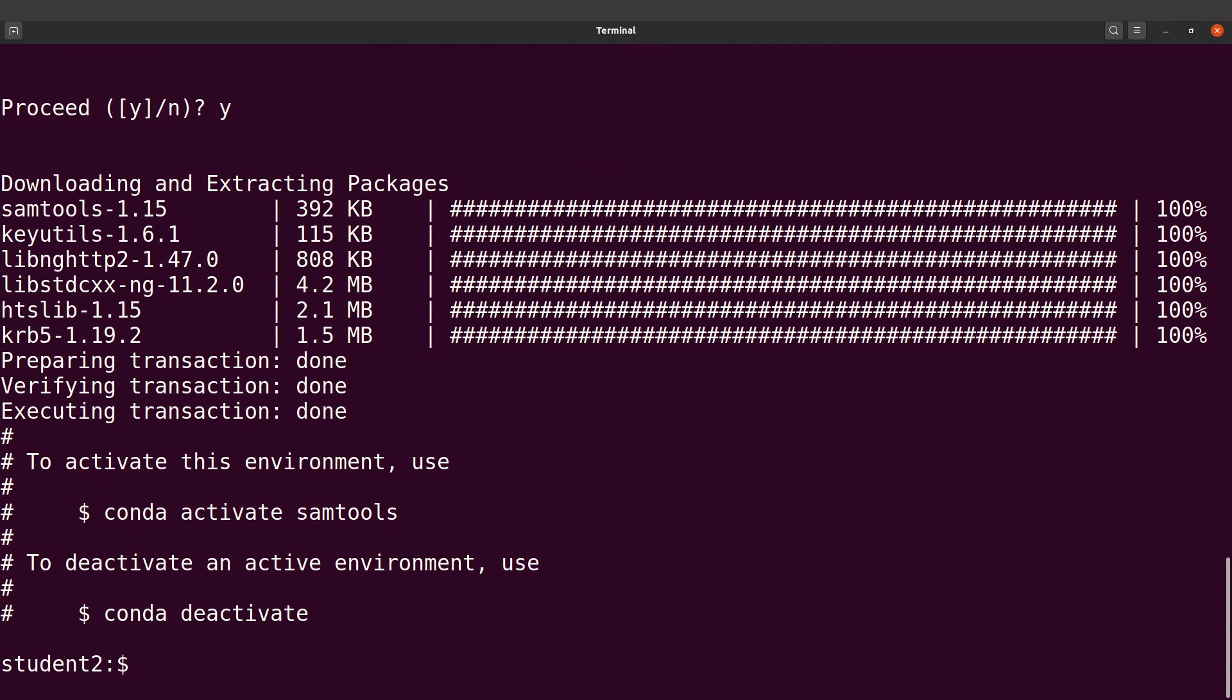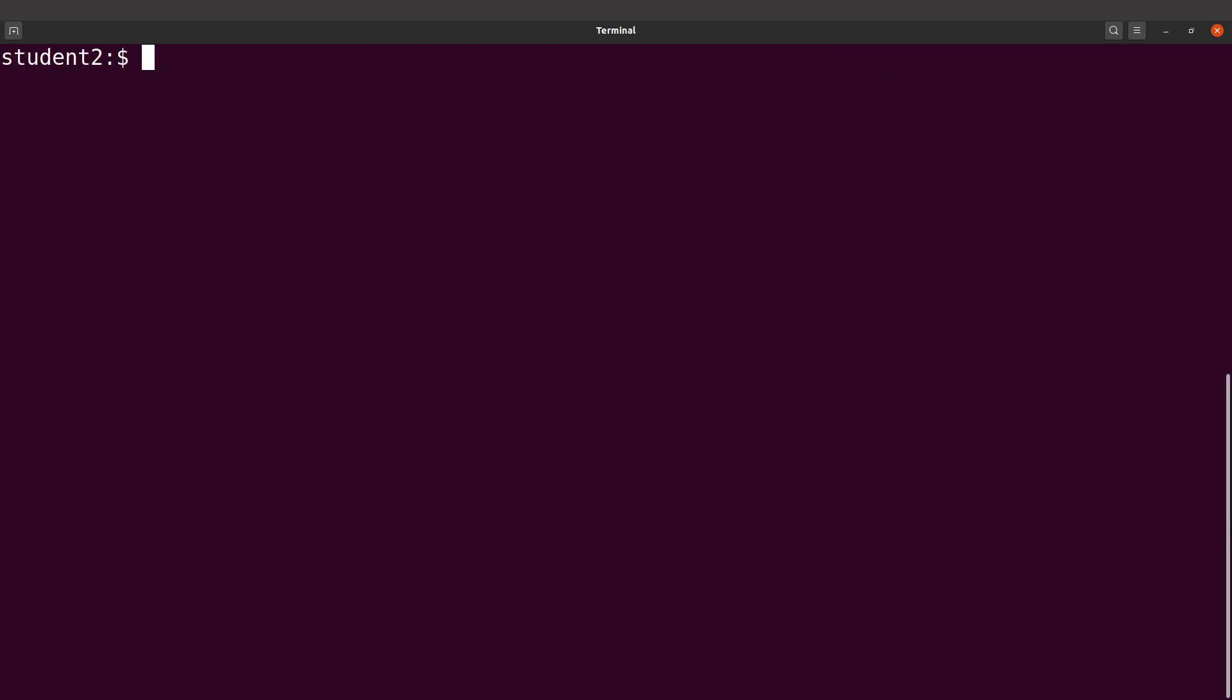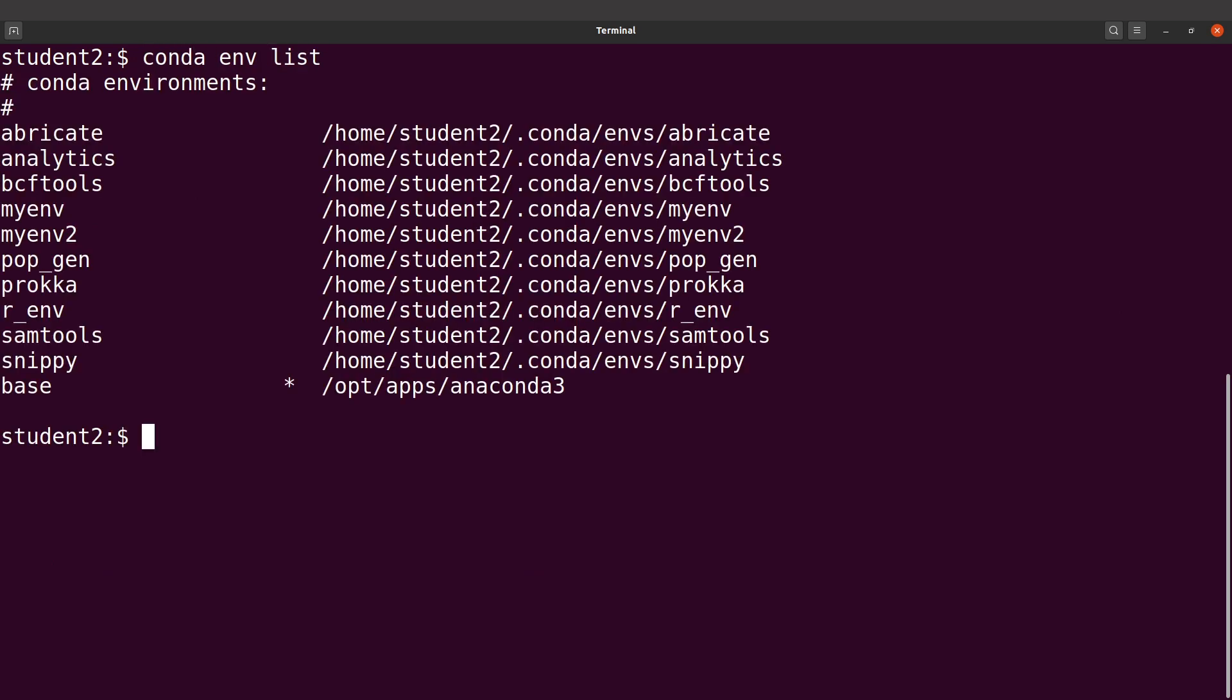Okay, so the environment has been created and samtools has been installed. Let's proceed. Let's clear the screen. In case you've forgotten the name of the environment you created, you can type conda env list - this will list all the environments. We have samtools here, this is what we need. So we're going to activate that environment.